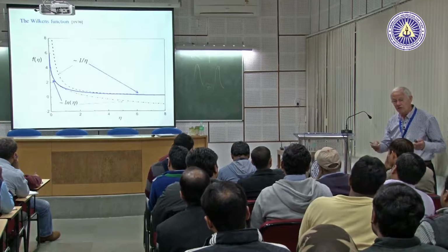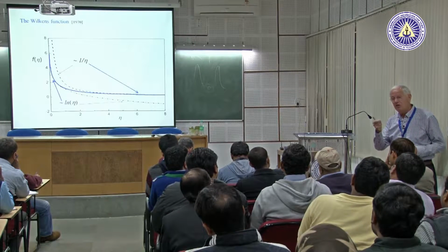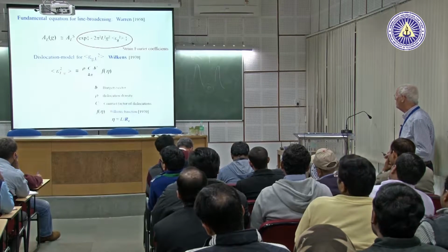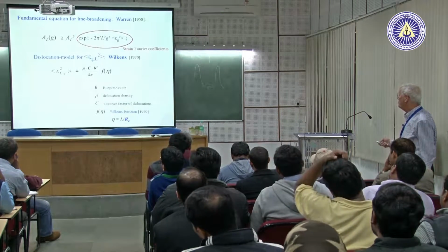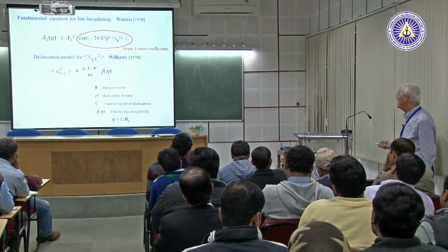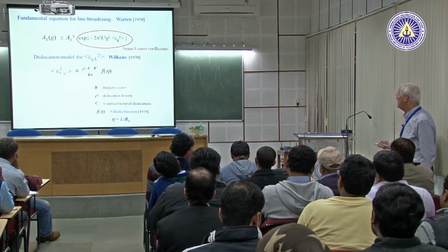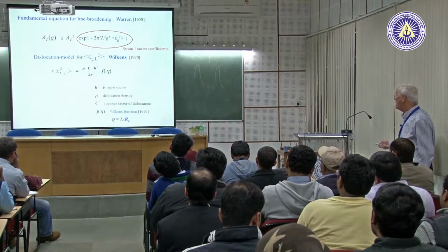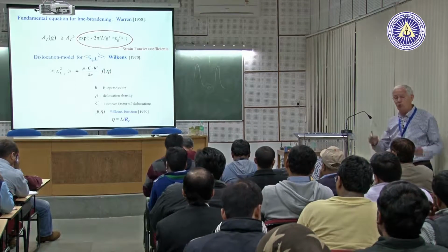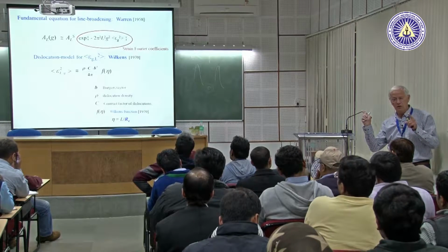And it contains the outer cutoff radius. So if we go back to that formula, we have the dislocation density, the number density of dislocations here. It is a proportionality factor. And we have the effective outer cutoff radius here. So both quantities are in this formula. Okay?